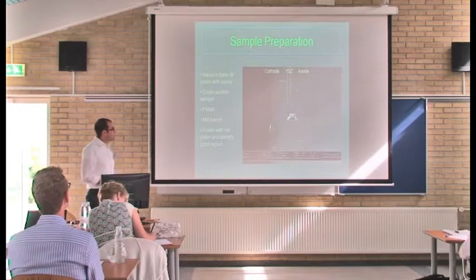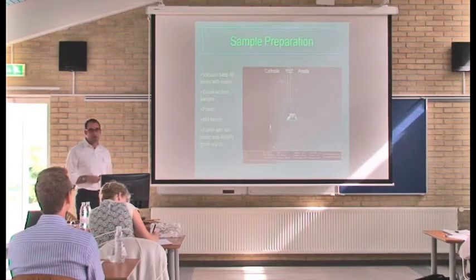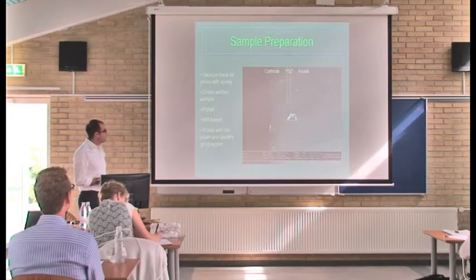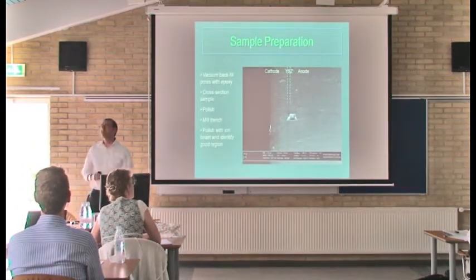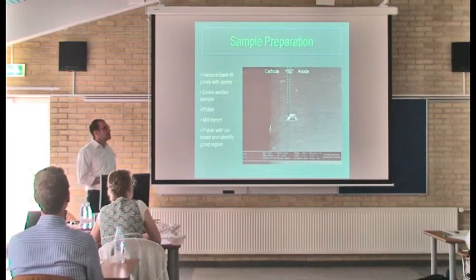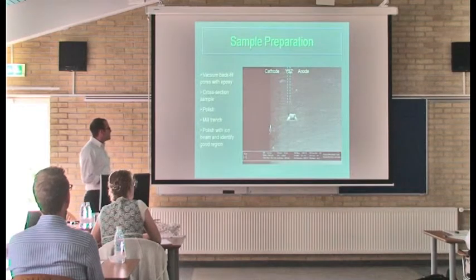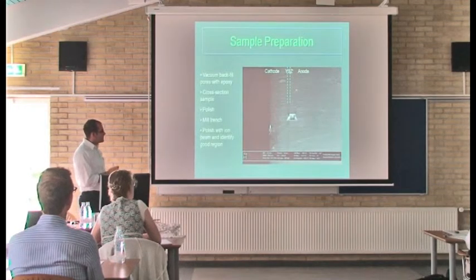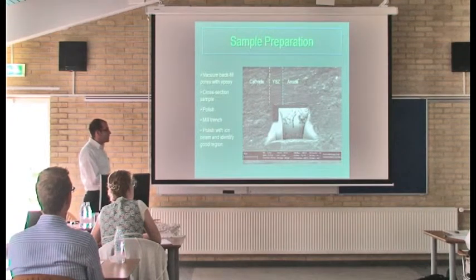So this is our sample preparation. Maybe a couple years ago, we started filling our pore structure with commercial epoxy, vacuum filling the pore structure. Then we cross-section our sample, polish it, and mill this trench out. This is a zoomed out view with the electrolyte here. We can do either electrode, obviously. Zooming in, we just mill out a square trench.